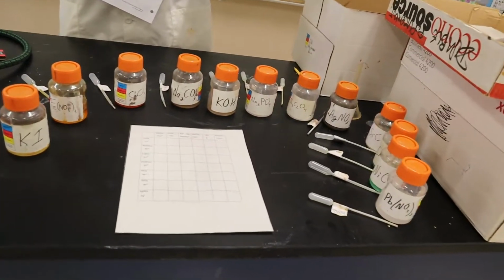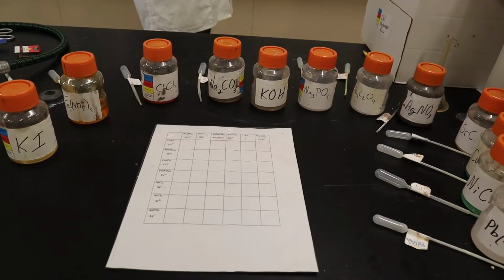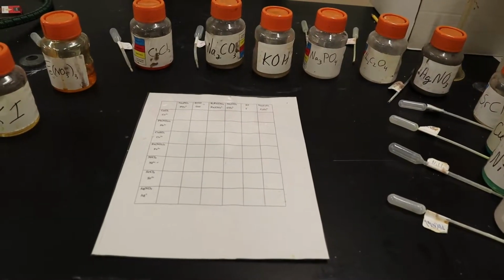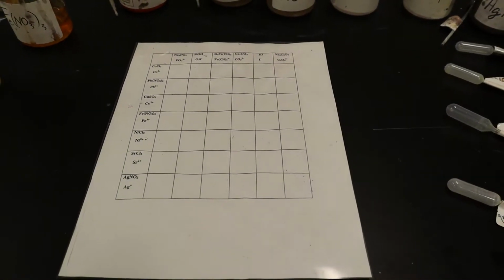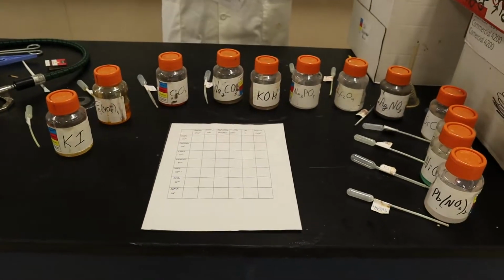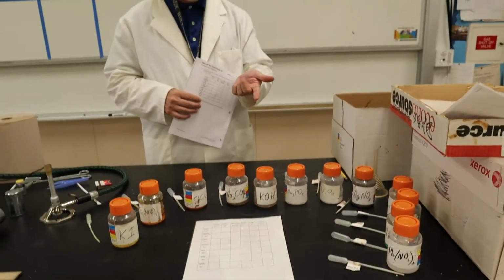And if you see one color precipitate, that means one of the products precipitated out. If you see two colors, most likely that means two precipitates. Both products precipitate out. If you see no change, if it just stays clear, it means neither product precipitated. Okay? It's a cool little lab. You see some really cool colors, maybe some gross colors.